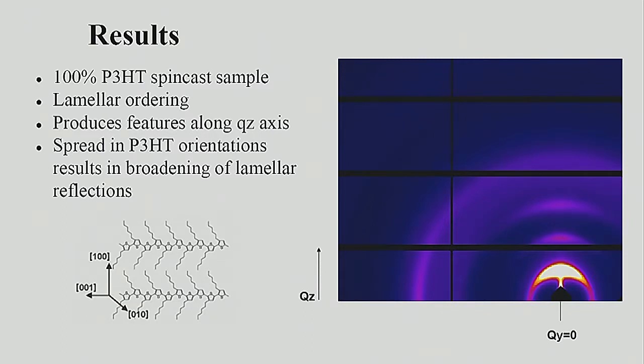So the detector is made out of what I assume to be very many smaller detectors, 8 or so in total. And the easy way to patch that is just to take this 10 seconds exposure of data, move it slightly, take another 10 seconds, and you can patch them together in an intelligent way.